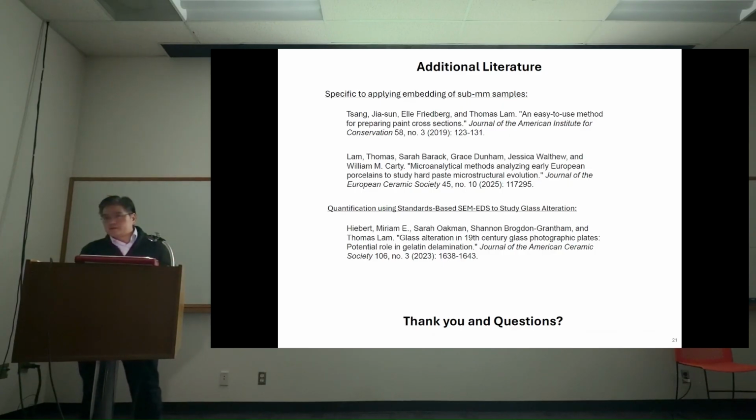Right. And we saw that it was like... Was the color they were after, or what? Well, the color, yeah, a little bit about the color. I didn't get a lot of the field notes on that. I think they wanted the major composition, but I presume there is a little bit of copper that probably could have given the color. Well, there's probably coloring, but that wasn't their question. They wanted to know what glass this is and how thick it is, just to get a familiarity with how badly it is going to degrade.